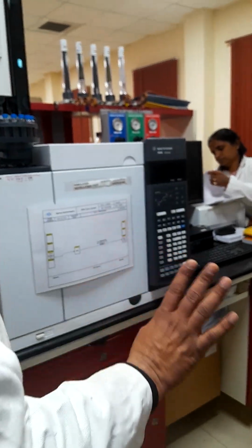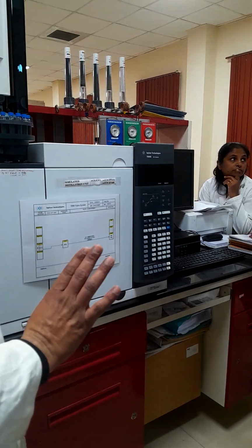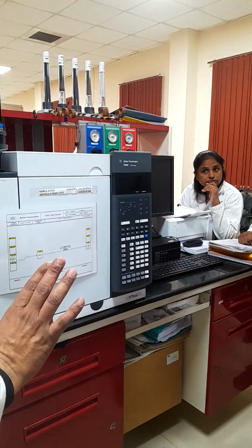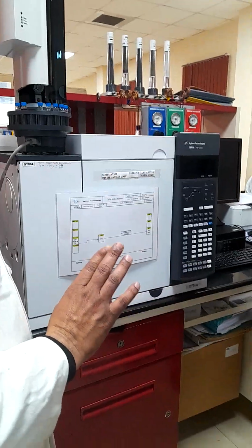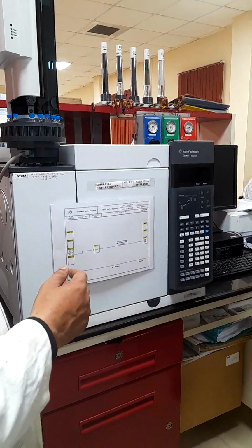Till there, any query? This is sample preparation. Do you just make the dilution or do you filter through any micron of filter? We can do filtration also, but here we are using only hydrocarbons. The pyrolysis samples we are getting are also hydrocarbons.